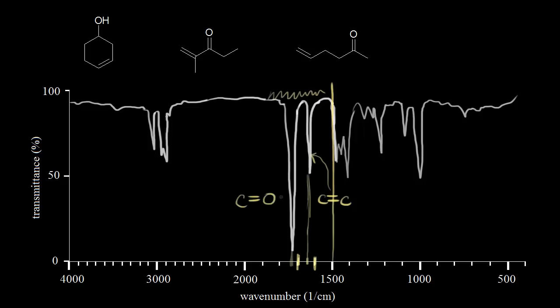So we can immediately rule out this one. So it couldn't possibly be that molecule. And that brings us to this, which is a conjugated ketone versus an unconjugated ketone.